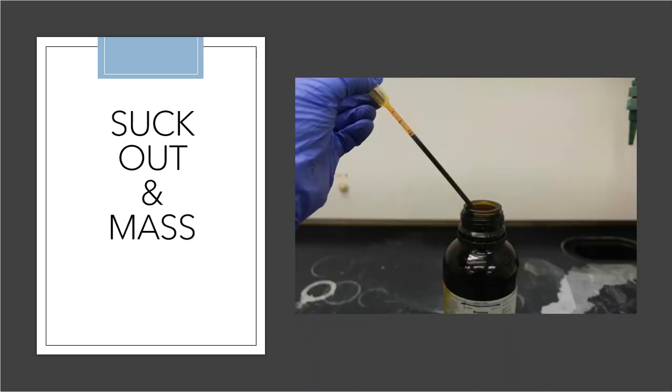And then I take a disposable pipette and I take it into my bromine and I suck out some liquid bromine, my Br2, right here. Well, inside of the pipette, you can see what's beginning to happen. It's actually beginning to fill the pipette up with this brown, orangey vapor as well, right? And you can even see some more of the brown vapor that might have gotten caught in the camera picture.